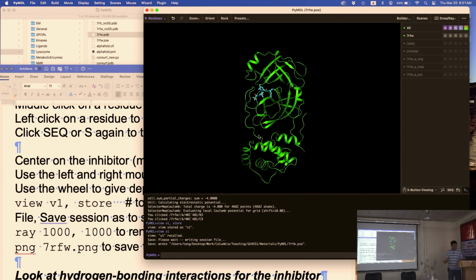Oh, yeah. So now you have a display like this. How do you make a nice figure out of it? A high-res figure for publication, because in the paper you need 300 dpi figures, right? 300 dots per inch, very high resolution. How do you do that? If you do a screenshot, it's not good enough. But it's good for your phones to send to your friends, send to your parents. But if you want to send it to a paper, you need something fancier than that.